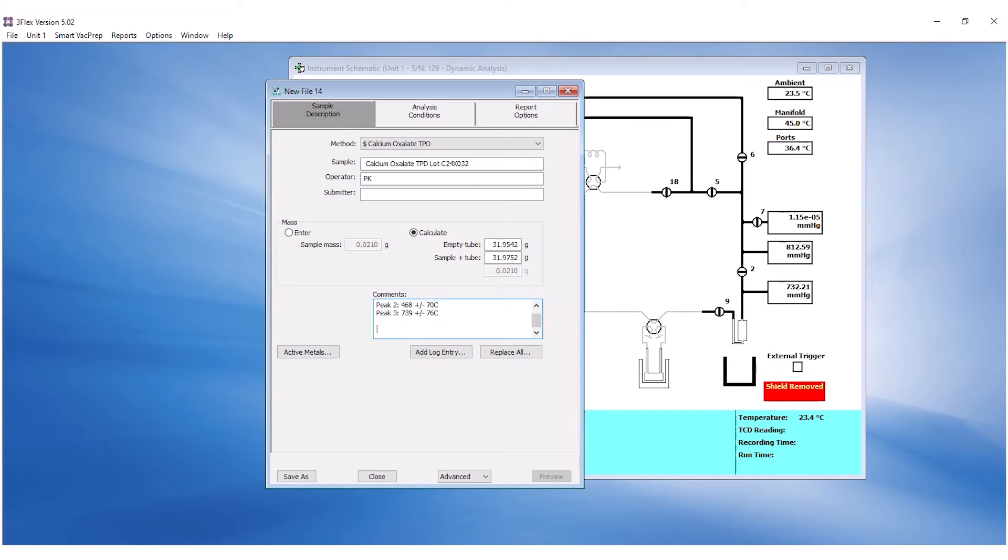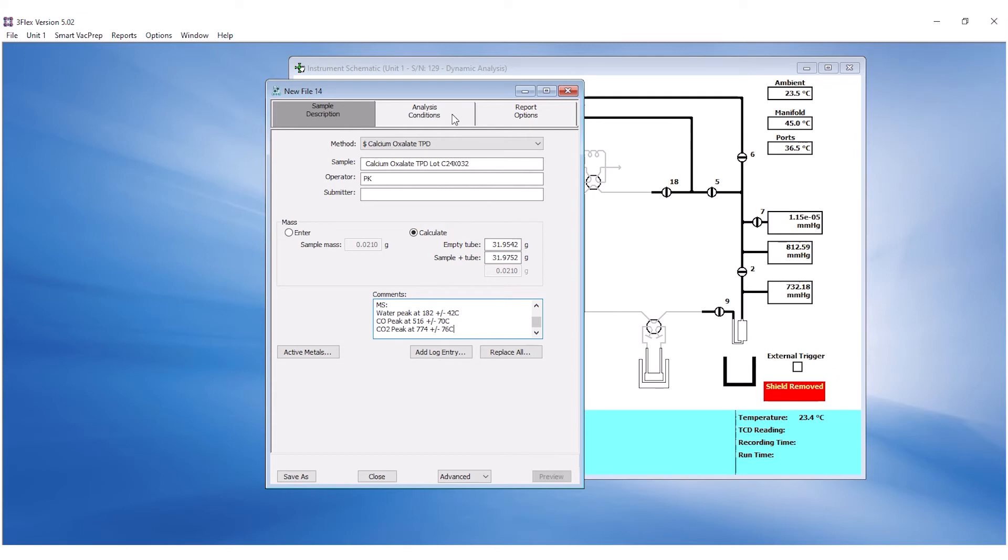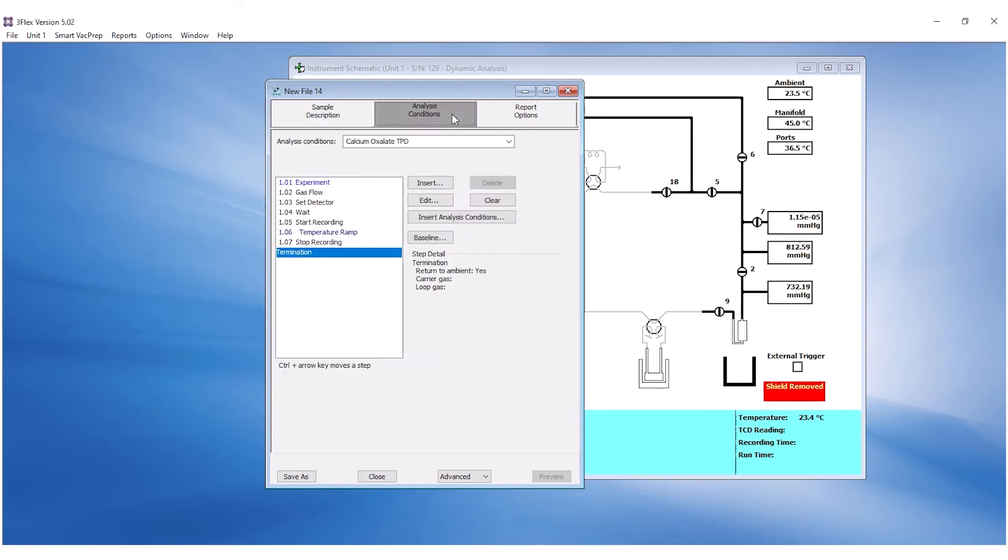If mass spectrometer is in use, enter temperature specifications for the water, carbon monoxide, and carbon dioxide peaks. Under the Analysis conditions, check if the method is loaded and update the conditions to the most updated method indicated on the reference material manual.